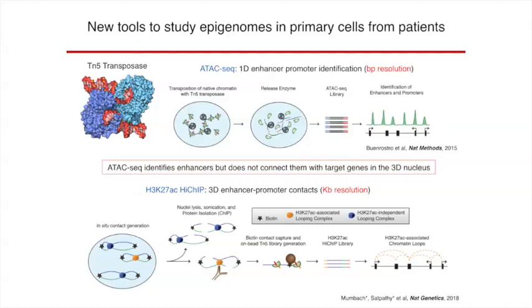The first technology is called ATAC-seq, or Assay for Transposase-Accessible Chromatin with Sequencing. This technology was developed by a former graduate student in the group, Jason Buenrostro, who figured out that you can take this naturally occurring transposase enzyme, a bacterial transposable element enzyme whose function is to cut and paste DNA across bacteria. Now we can engineer this protein to carry Illumina sequencing adapters, and then just dump that complex enzyme onto either cells or nuclei.